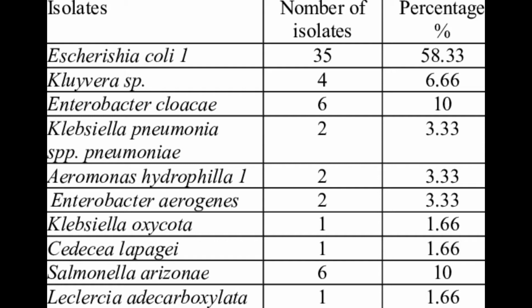The rapid indole spot test uses the reagent p-dimethylaminocinnamaldehyde, where negative is no blue. It is a useful test to differentiate P. vulgaris from P. mirabilis. Now let's talk about the methyl red and Voges-Proskauer tests, which determine the pathway of glucose metabolism.